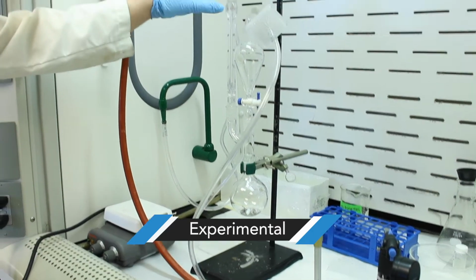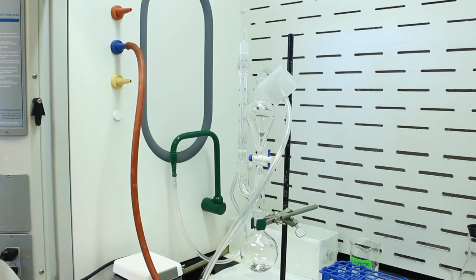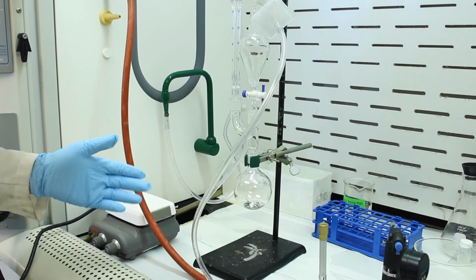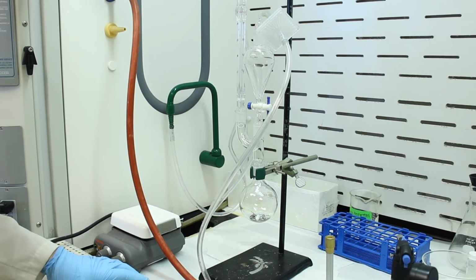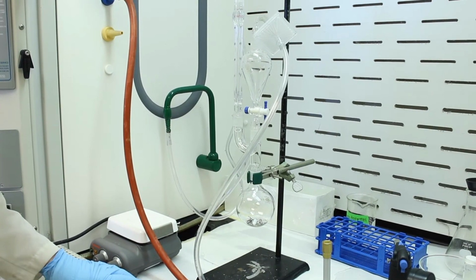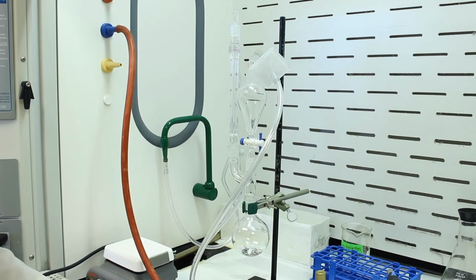Okay, so we have our apparatus here. This is probably the most complex apparatus we've ever had. And as I stated, this is the most challenging reaction to perform in this sophomore organic chemistry class, simply because it's very sensitive to water. That's the issue we're dealing with here.